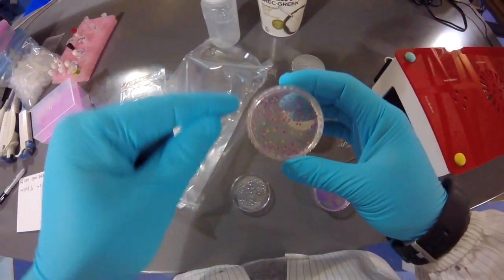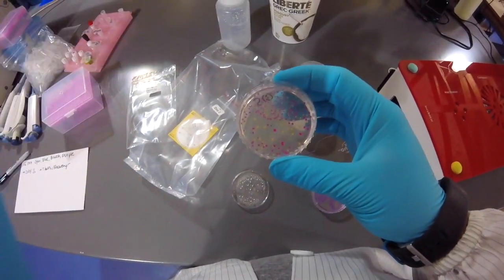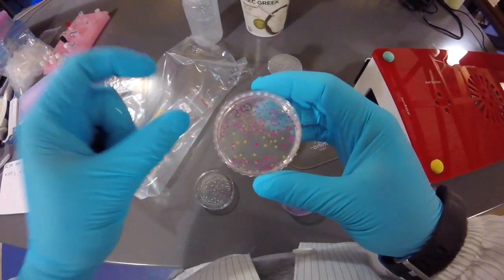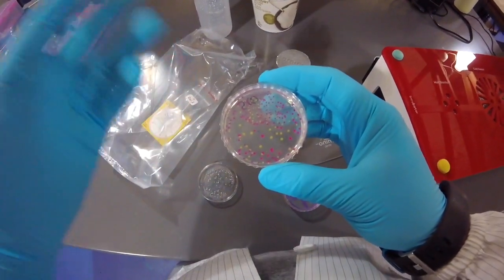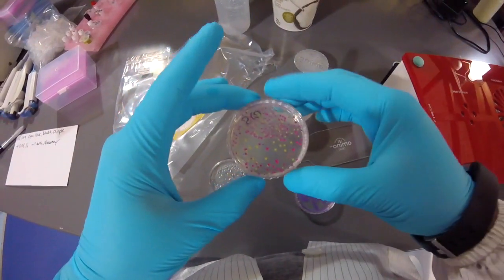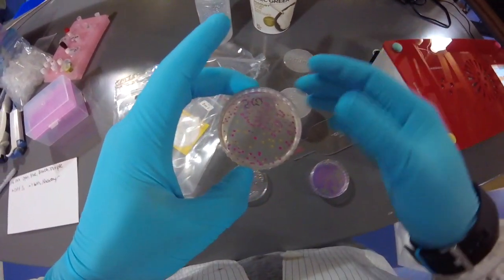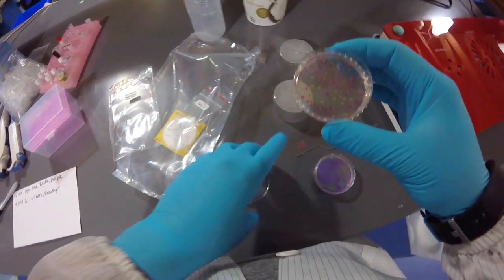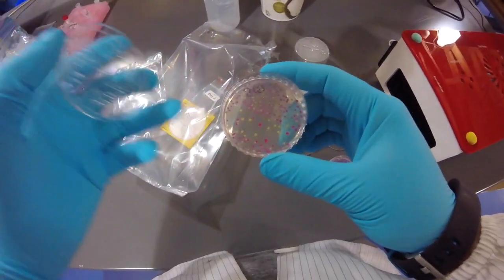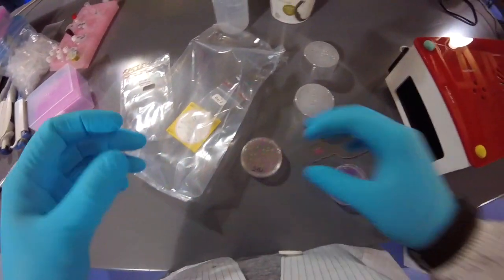So if you counted all these colonies, that would give you an idea of how many bacteria took up plasmids within your transformation mixture of cells and DNA and all that. That's a fun exercise you can do, simply count the colonies and see how many bacteria. But remember, you only poured about half of your cells on the plate, and so you don't have the full story if you just were to count these colonies. Alrighty, happy genetic engineering.